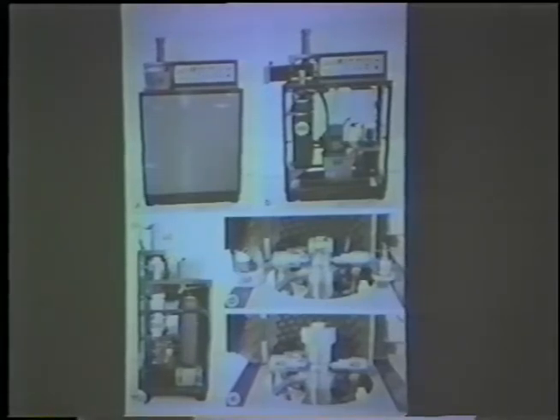Our prototype has rubber feet, so it isn't as bad. But Andrew was using a prototype that didn't have rubber feet, a year and a half ago. And someone came down from one of the upper floors who was trying to do micro-injection of tissue culture cells. And he had lost several cells in several pipettes. And he was coming down to find out what the hell was going on. He asked them to please tell him when we were going to be running the machine.